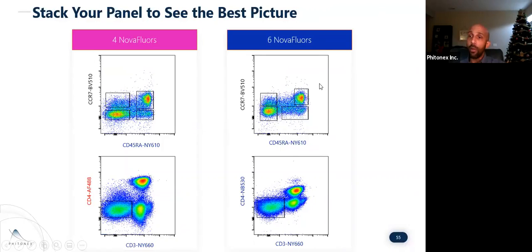In addition to that, since we had that improvement in spillover spread matrix, we're going to get better resolution, which is going to enable you to set your gates a little bit easier and find those populations more accurately and just clean up your data and really see the improvements that you should see whenever you improve your resolution.